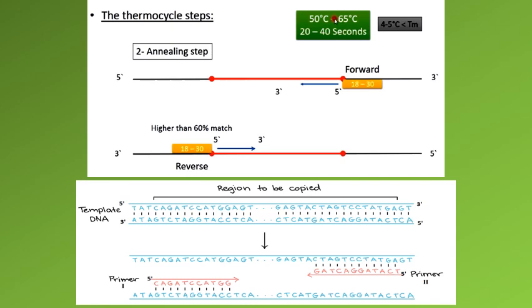In this figure, we perform the step of annealing by adding two primers, forward and reverse, as starters for this bioreaction technique.